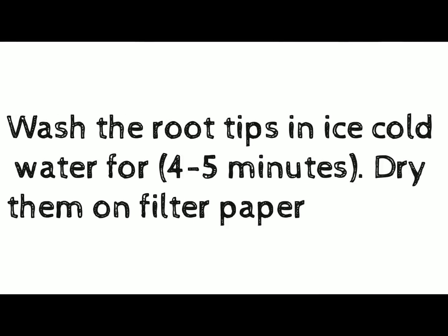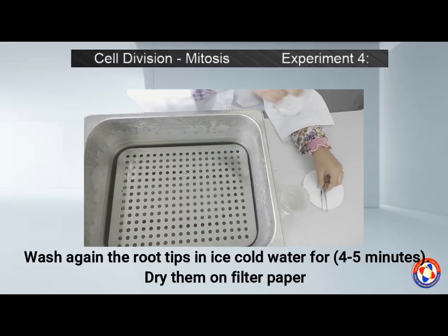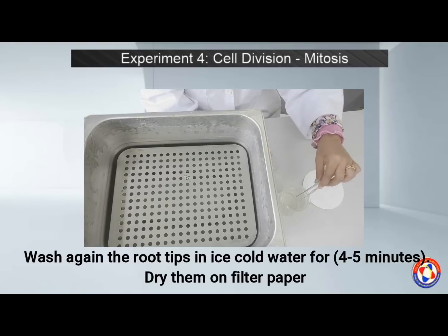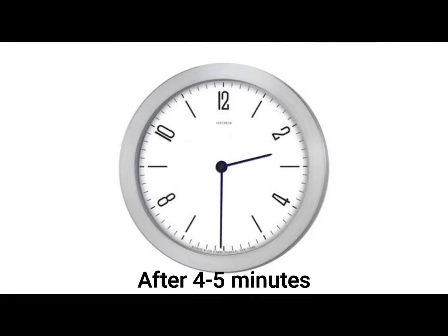After 5 minutes, take out the root tips and again wash them in ice cold water for 4–5 minutes. After that, let the root tips dry on filter paper. Be extra careful when handling your root tips at this stage, because they are now very fragile.